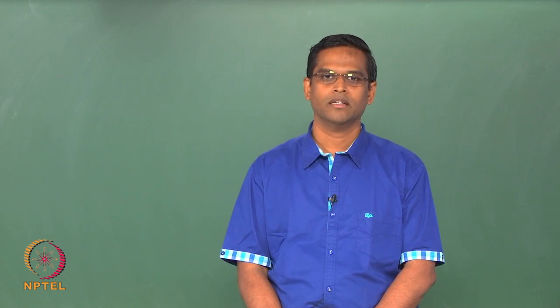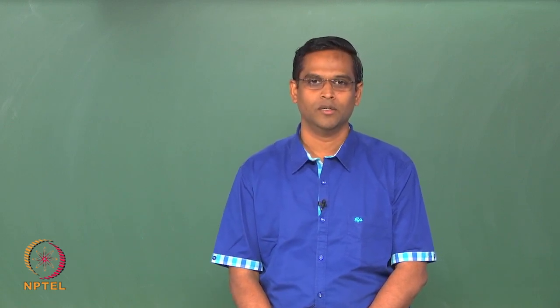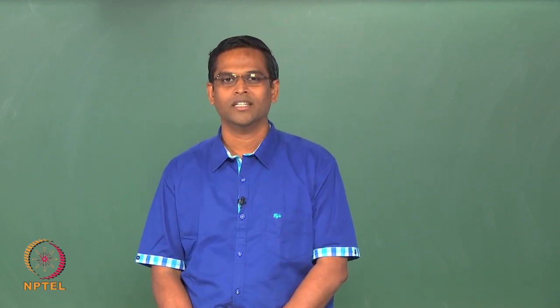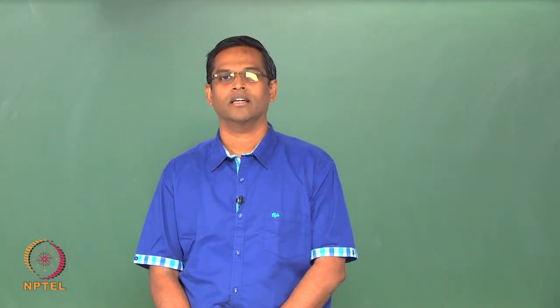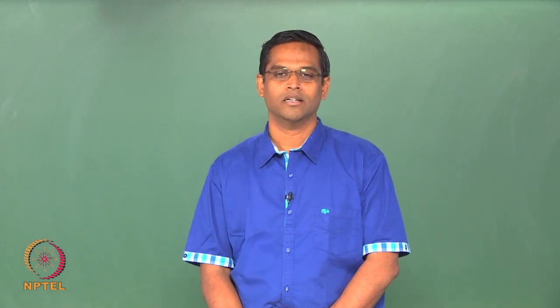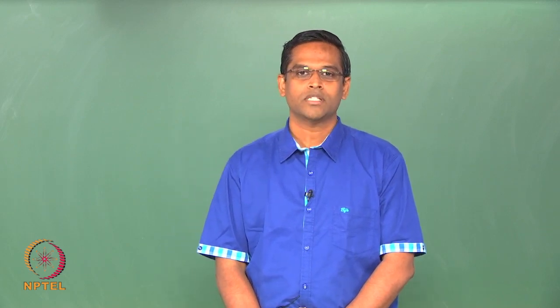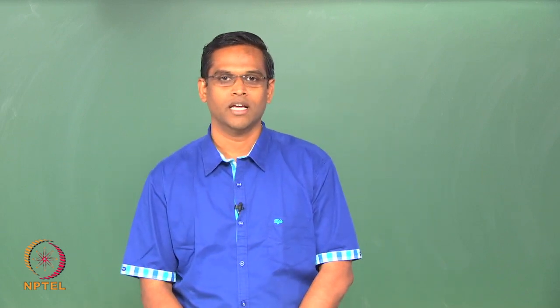Hello, welcome back. In the last class, we were reviewing the resolution, the numerical aperture, and then spatial resolution, a little bit about magnification, and then empty magnification, all such parameters. Today we will continue along those lines, and you just look at the slide which we talked about in the last class.